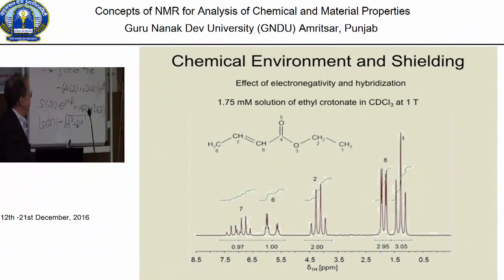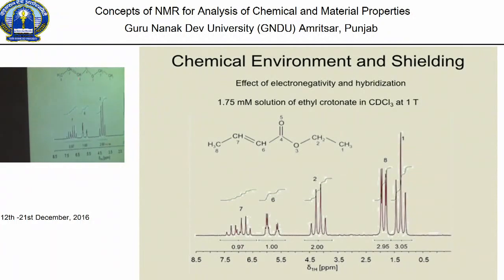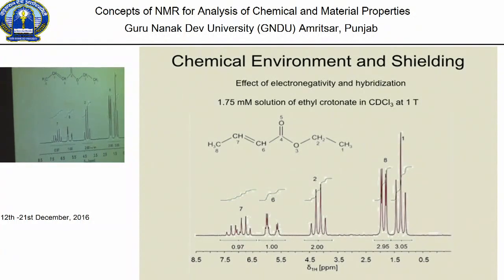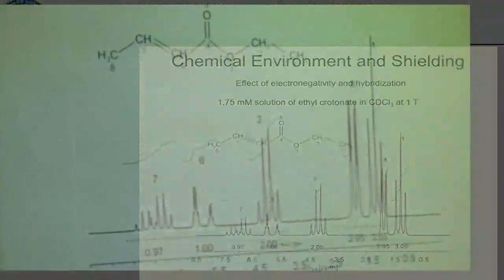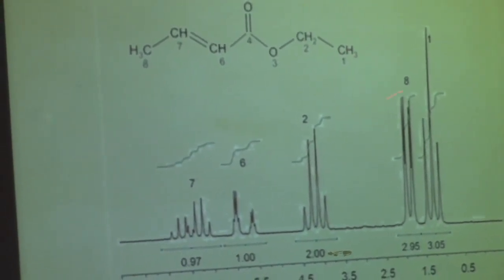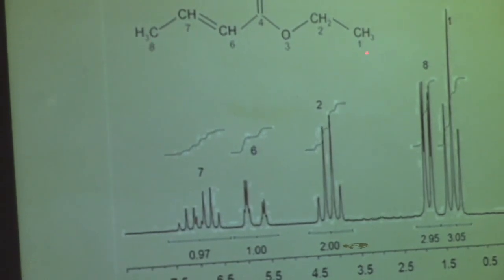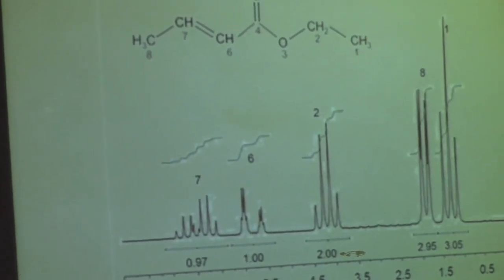Now we have a whole range of different groups. There's a CH3 group here, there's one there, the CH2 group and CH groups. So as a general rule of thumb, we expect now that the CH3 groups are more shielded, so that it should appear on the right. And right now you wouldn't know if this CH3 group or this is more shielded.